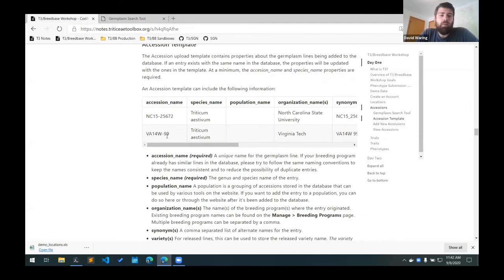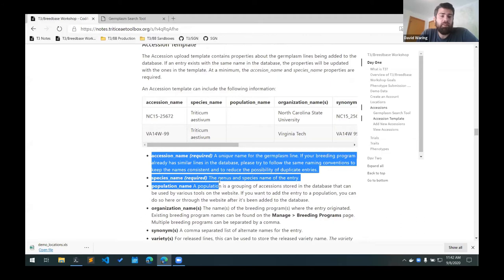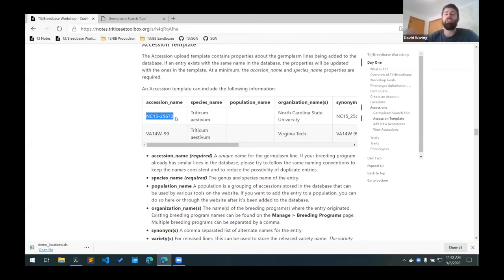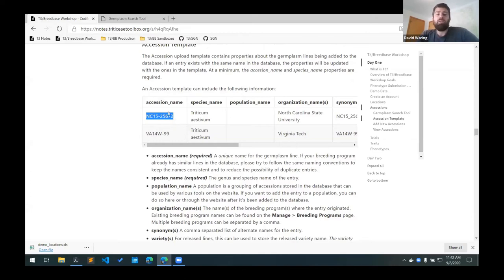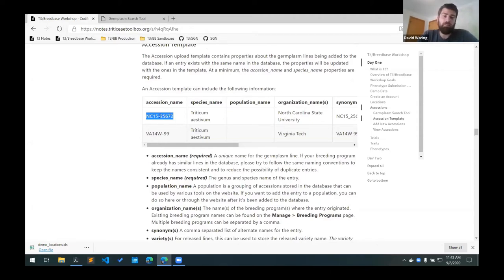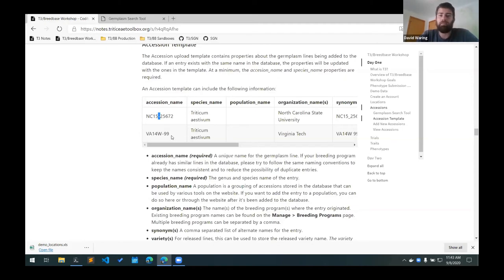So the properties for this template, there are two required properties and they are the accession name and species name. The accession name has to be a unique name for the germplasm line. And we ask that if your breeding program already has some similar lines in the database that we ask you to try to follow the naming convention that was already used in the past. So if your breeding program uses a dash as the delimiter, we ask that you continue to use the dashes as the delimiter so that way we can try to reduce the possible number of duplicates in the database.